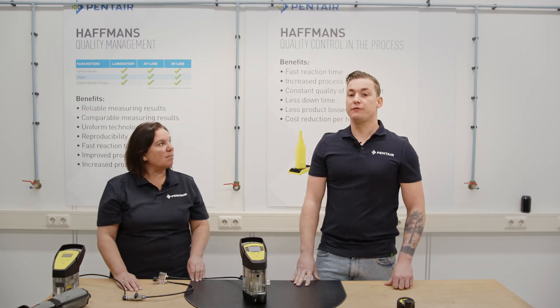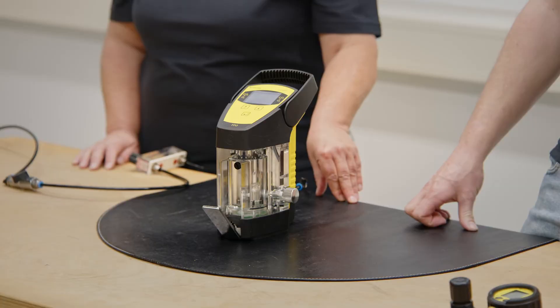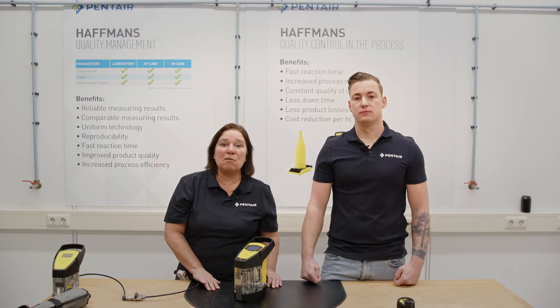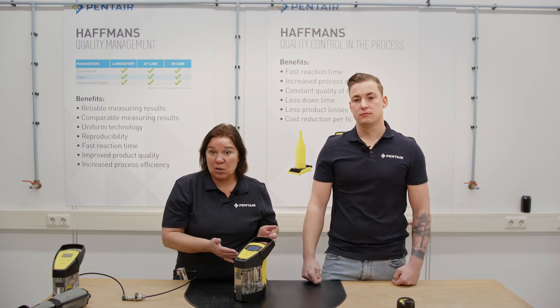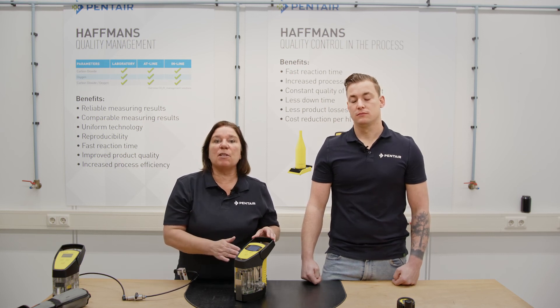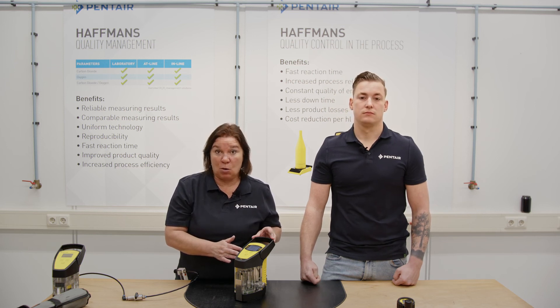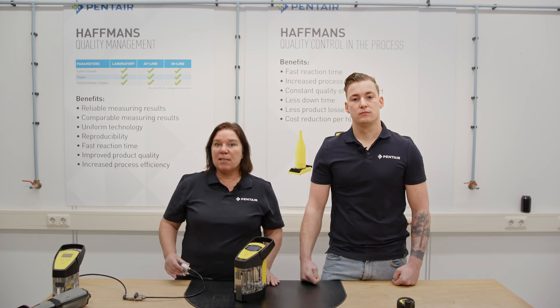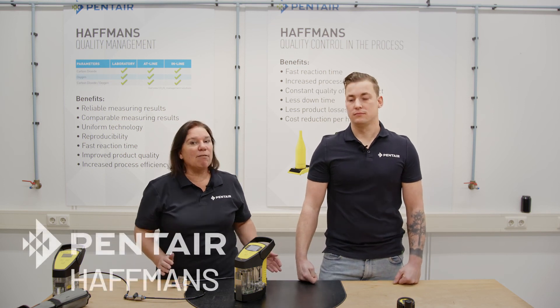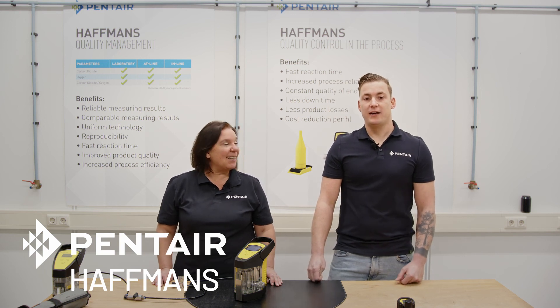After calibration, do not forget to put the adjustments back to liquid medium and change your measuring unit back to PPB. Thank you very much for watching us and we hope you enjoyed it and found it useful. A good oxygen sensor will result in good and reliable dissolved or gas oxygen measurements. When you have questions please contact us via the link with this video, and browse for more videos on our Tech Talk channel. Bye, and don't forget to like us.